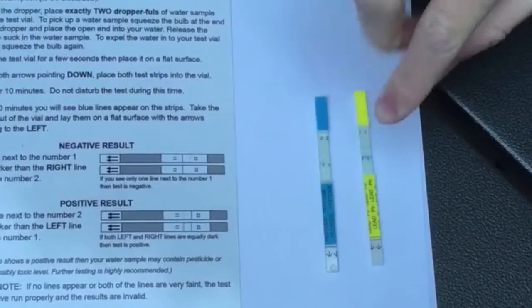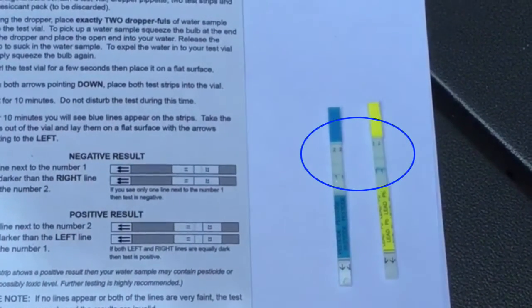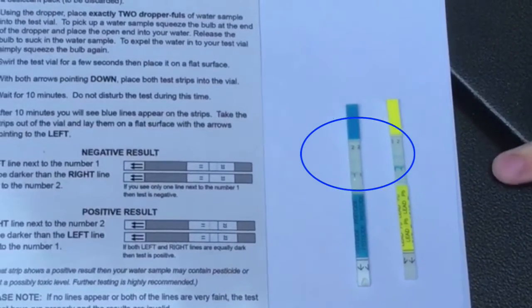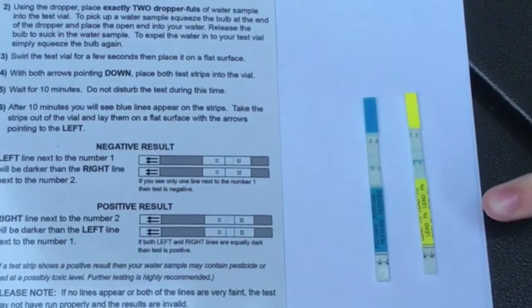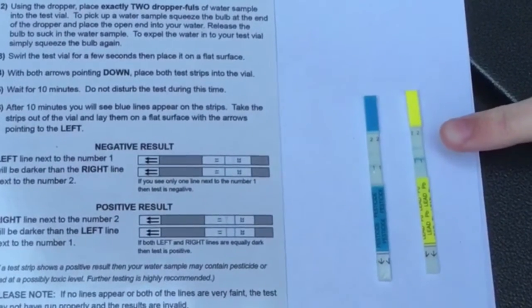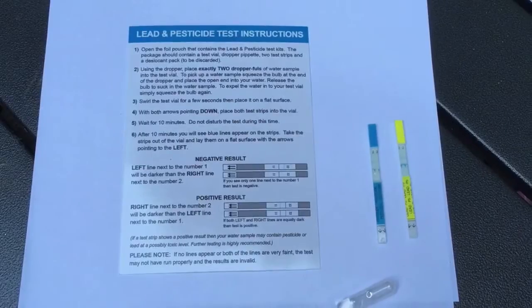It's been ten minutes, and now we're going to look at our results. There are two blue lines here — one's darker than the other on both sides. It says that if the line next to one is darker than the one next to two, it's negative. And if the line next to two is darker than the one next to one, it's positive. It looks like both results are negative.